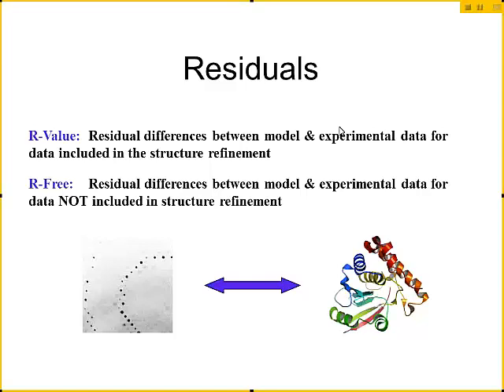So the 95% working data is what is targeted in the minimization, in the refinement. Because it's a very complex pattern going from small changes in the structure to overall changes in your diffraction pattern, sometimes you can make changes that are fitting noise in your minimization procedure.